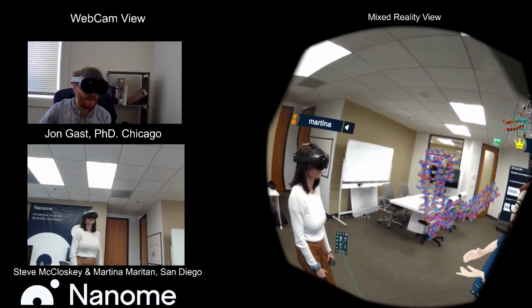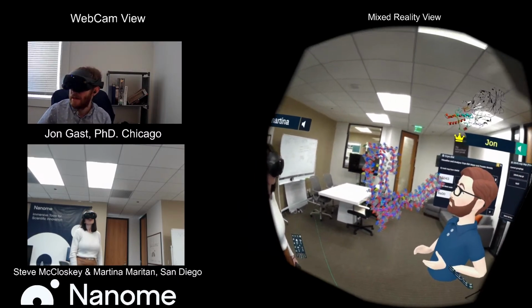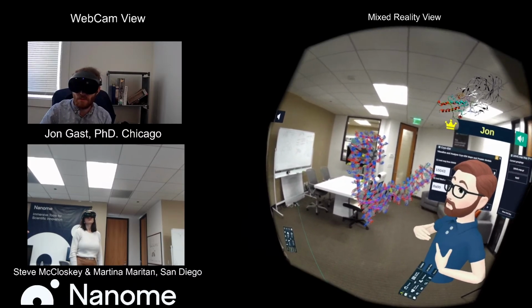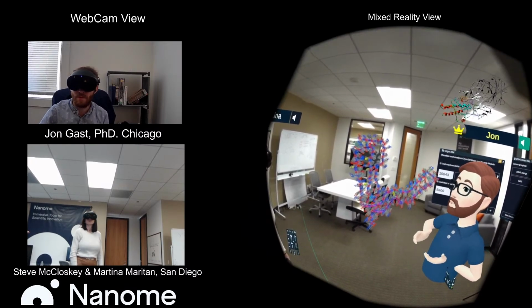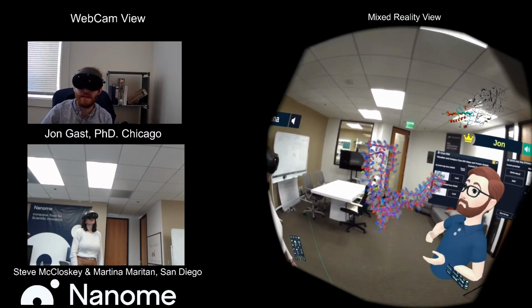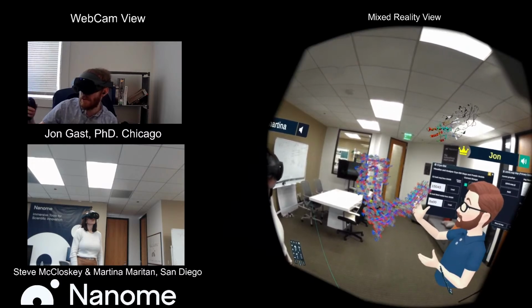One thing we saw is that this was 2.6 angstrom, a very great resolution, and there are a lot of conclusions that we all shared together. Sometimes in the course of a project, this can be transferred from group to group or even from role to role really easily with Nanome. But even beyond that, just on their own, people assessing these structures.